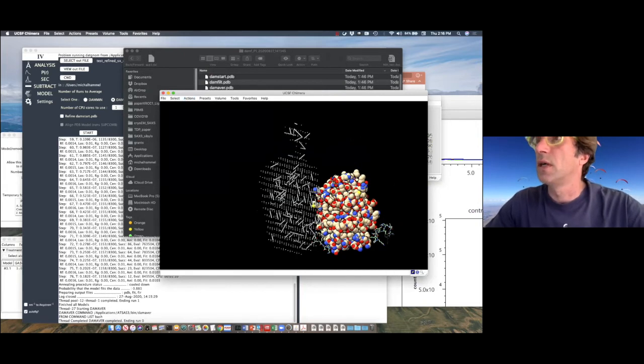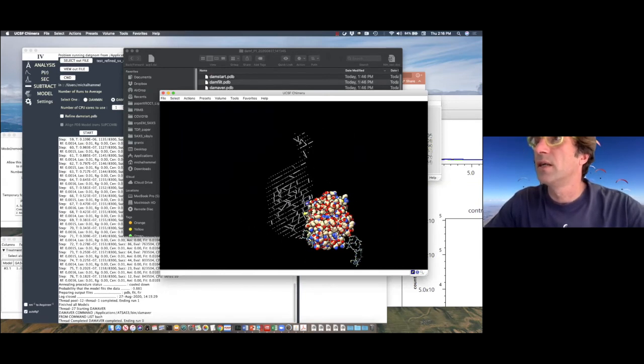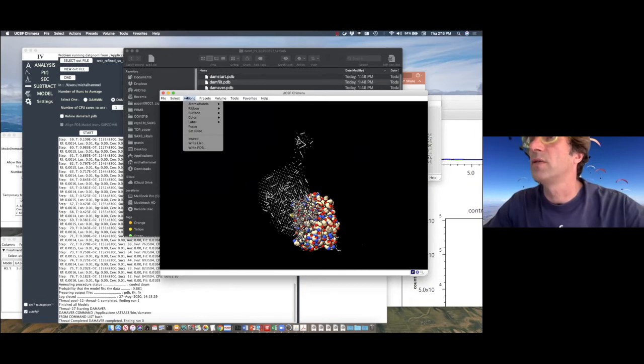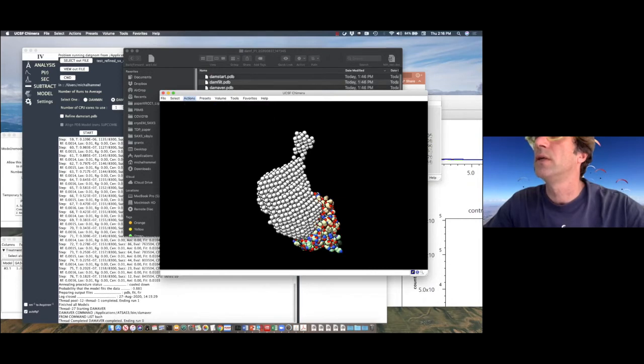So this is how it looks, and surprisingly, in this case there is nothing special to see here, but it really shows that it works. Let's show it in a sphere.